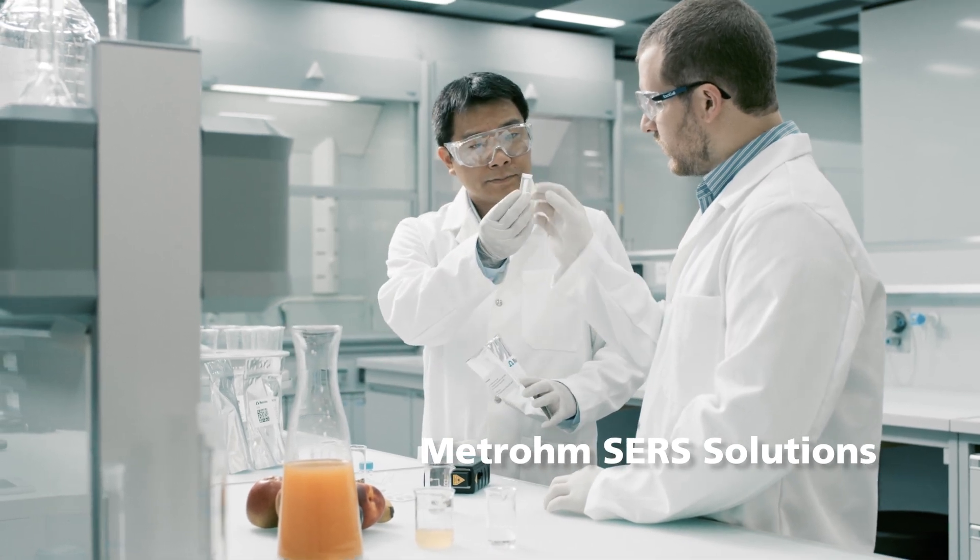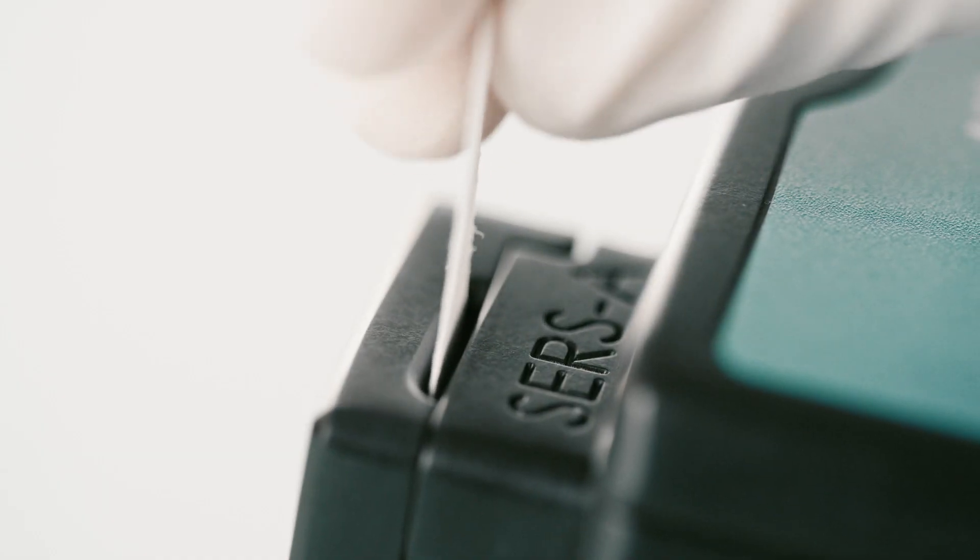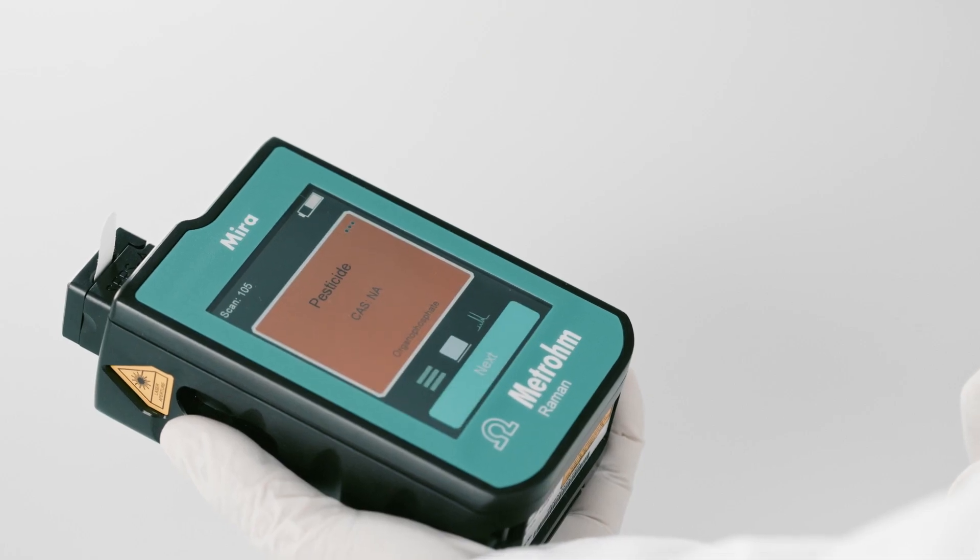This demo went really fast. Are you ready? Dip. Insert. Touch a screen. Save the result. And that's it.